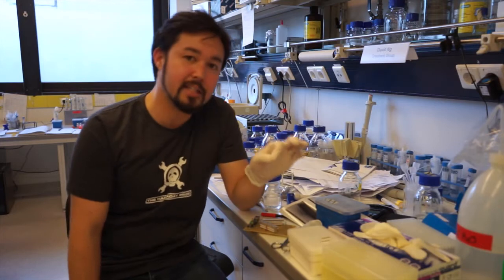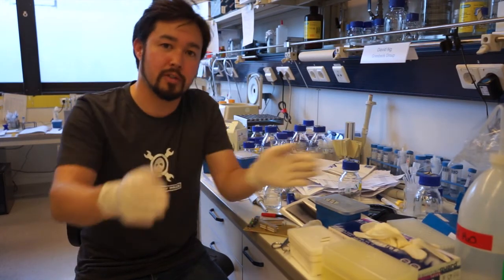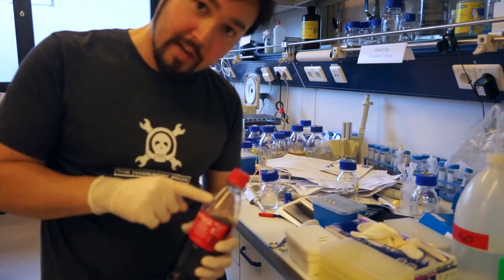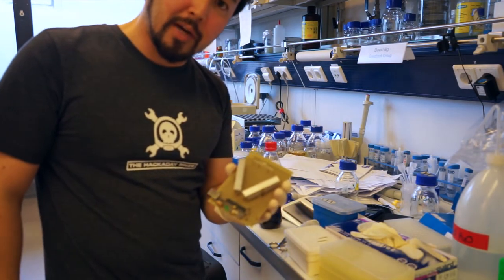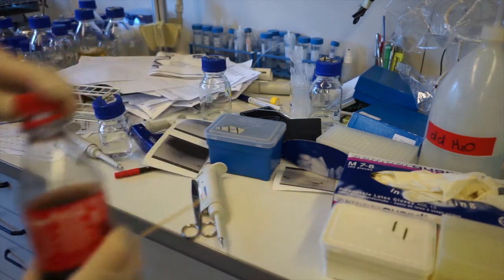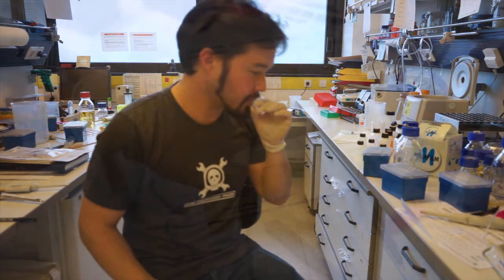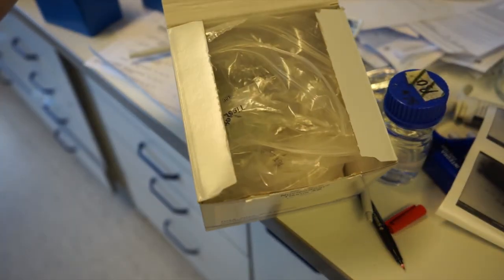We can take a tiny sample from a crime scene, make millions of copies, and then compare that to records in a database to identify people. We'll be taking a sample of DNA from the crime scene and amplifying it in the Polymerase chain reactor. Potential suspect's DNA is collected from saliva. Then the DNA is extracted with a standard kit. It takes about an hour or so and doesn't require any special equipment.